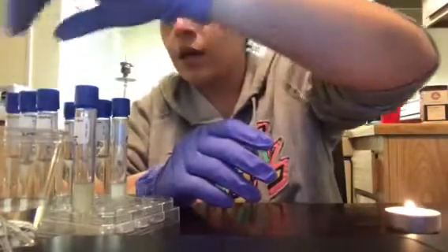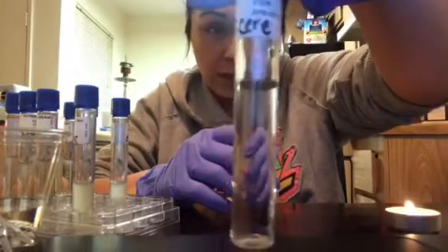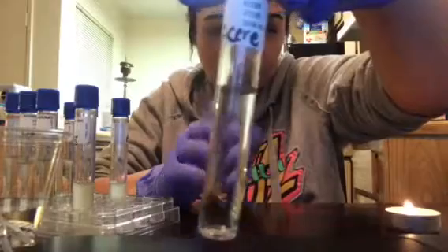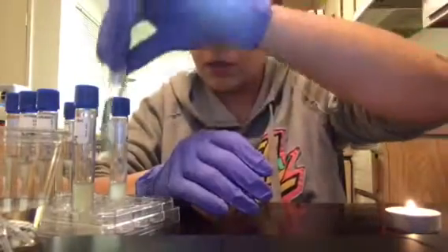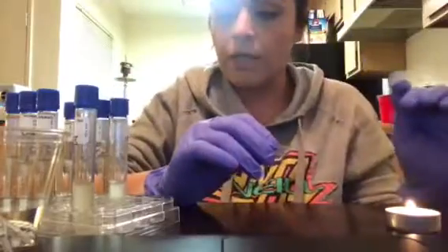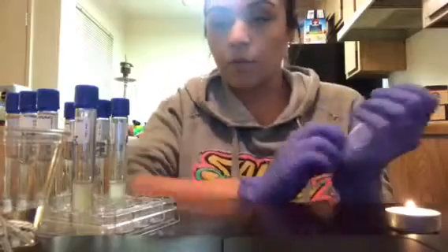That's the epidermidis. This is the S. cerevisiae. I always get that mixed up. But yeah. So I'm going to let that sit for 48 hours, and then I will take a look at them afterwards and document it.